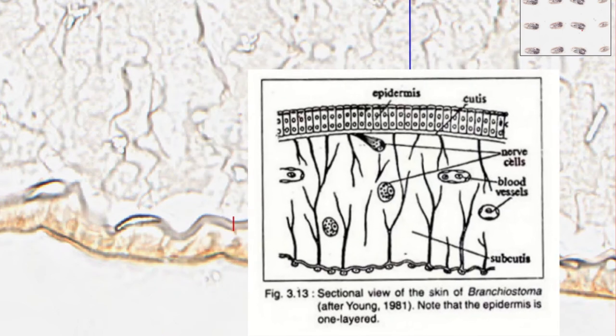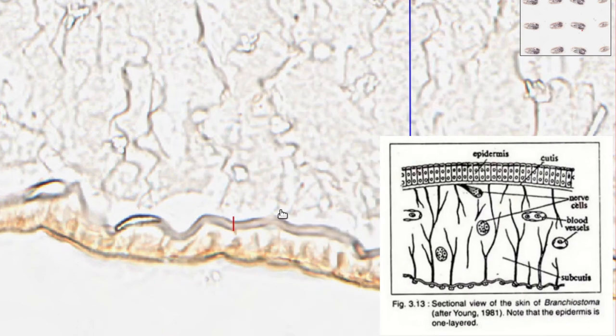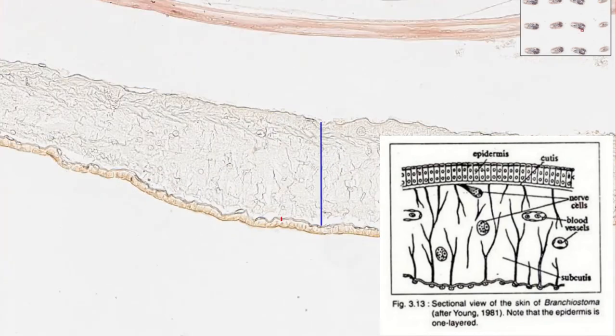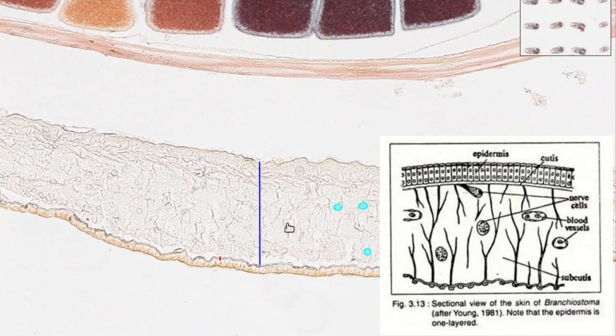So now if we switch the view to another area of the slide, we can see that below the epidermal cells there's a very thin layer, maybe about seven micrometers thick, just below the epidermal cells. If we refer back to our diagram of the skin, this is called the cutis, which means that the tissue below it must be called the subcutis because it's underneath the cutis. So the subcutis will refer to all of this connective tissue under here from the tip of this blue line to the other end.